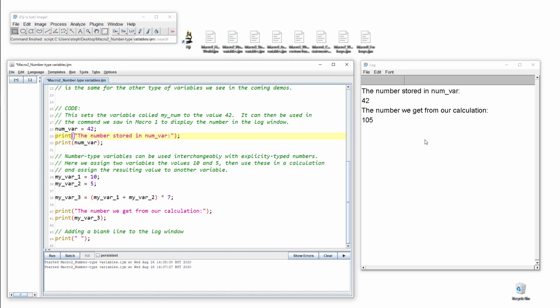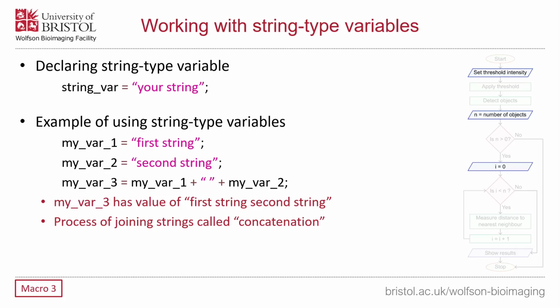But yeah, so that's all worked well, and we can move on to the next bit, which is actually looking at strings. So strings fundamentally, like the assignment of them, works in a similar way to how it does for numbers. We are defining a variable name here, like our reference, and then using the equal sign and specifying our hard-coded value with the semicolon at the end.